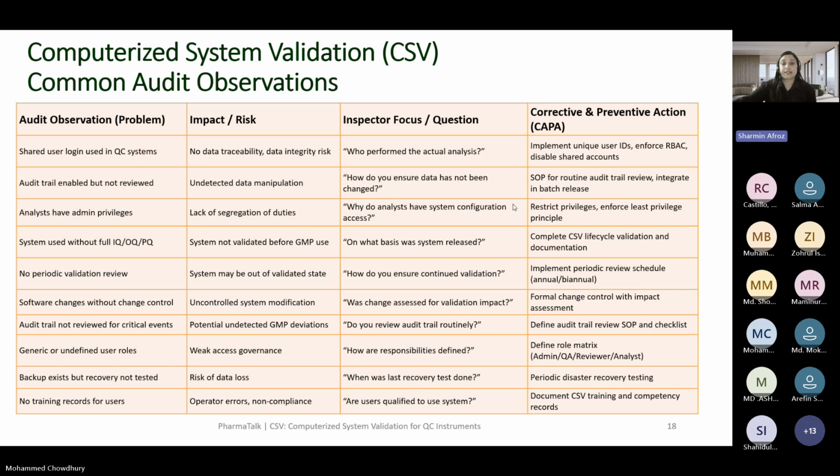Then I think there are not too many levels. The levels are limited, like 2 or 3 levels mainly: supervisor, operator, and admin. But a supervisor cannot create any recipe.